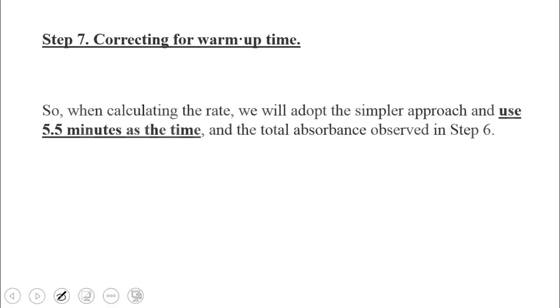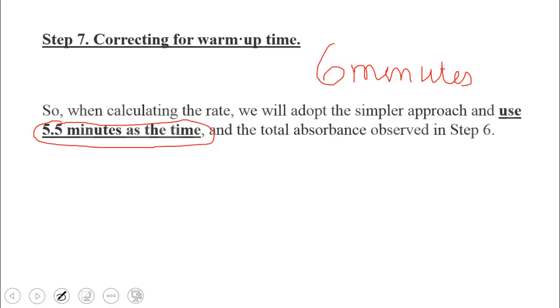The authors of a particular experiment that I utilized some data from found that if the test tube is in the water bath for 6 minutes, we're actually going to state that the reaction time is 5.5 minutes, allowing 30 seconds or half a minute for warm-up time, in that the reaction has not effectively started for a half minute.